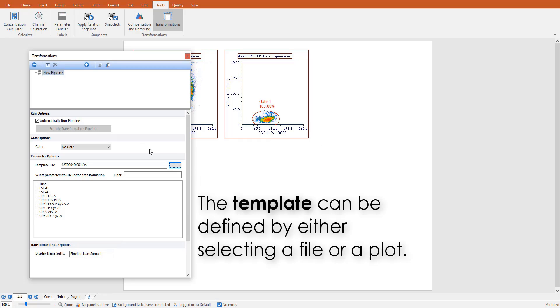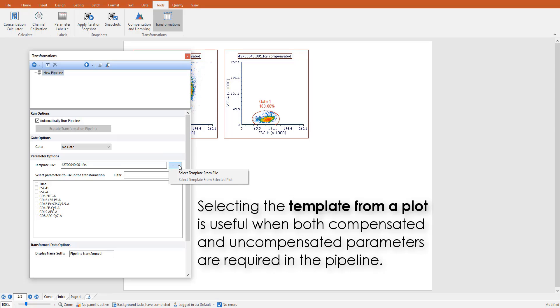Of note, the parameter list can be defined by either selecting a file or a plot from the layout. The latter is especially useful when both compensated and non-compensated parameters are required.